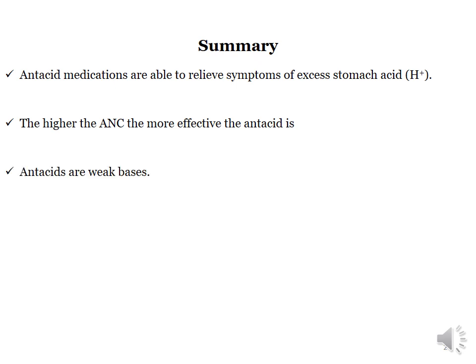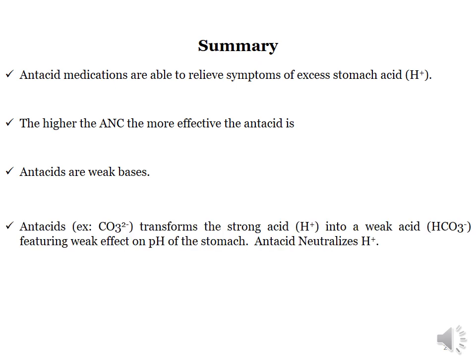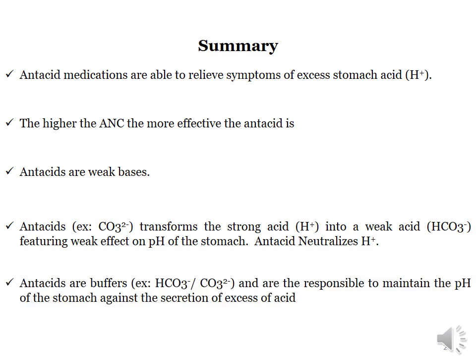Antacids are weak bases, and when they are in a solution in the presence of a strong acid, they will neutralize it and transform it to a weak acid. At the end of the reaction, we will obtain a weak acid and the antacid, and this will constitute the buffer that will maintain the pH.